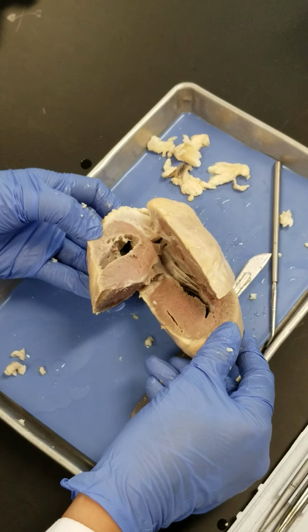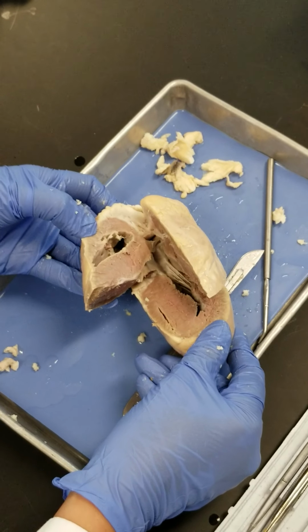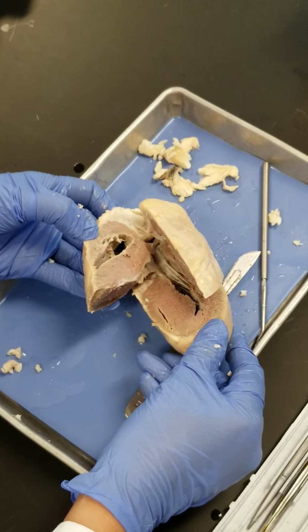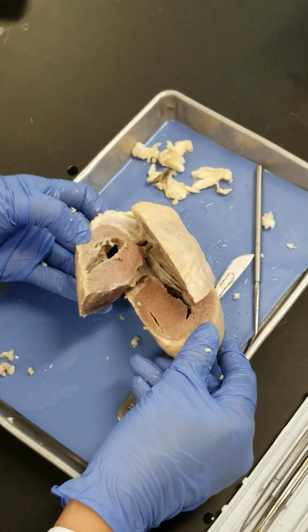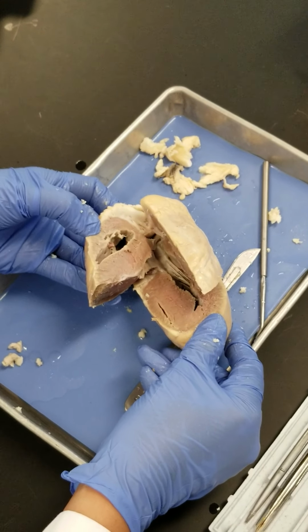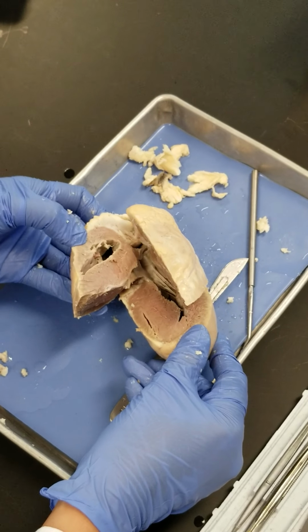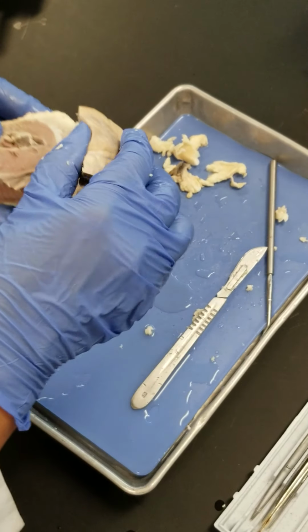What are you searching inside? The valves. What about them? One is going to be tricuspid, one is bicuspid, one has three cusps, and one has... That's the worst clue that you can search for, because that's very hard. When the heart has been dissected, now you can put them back together.